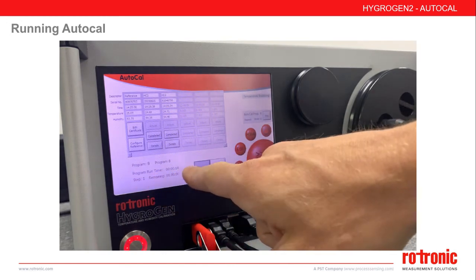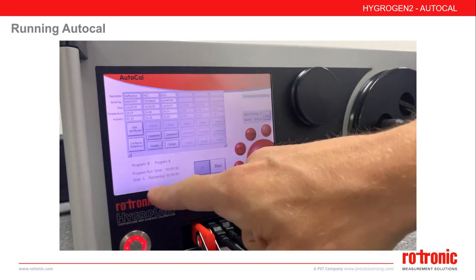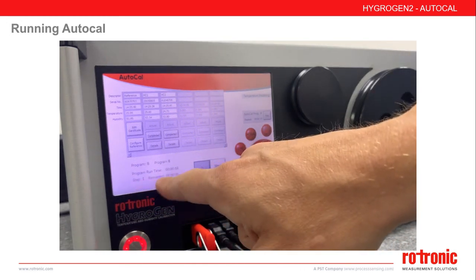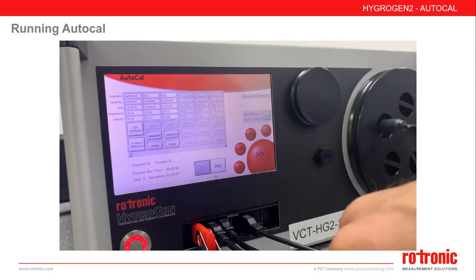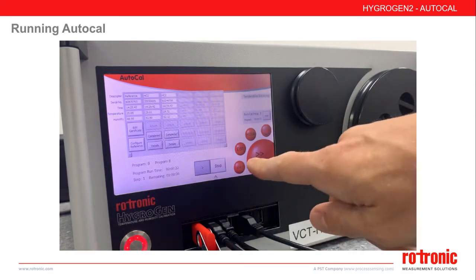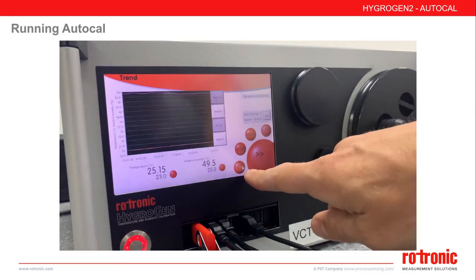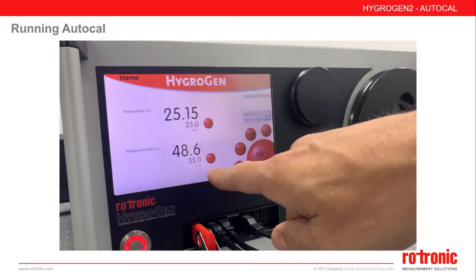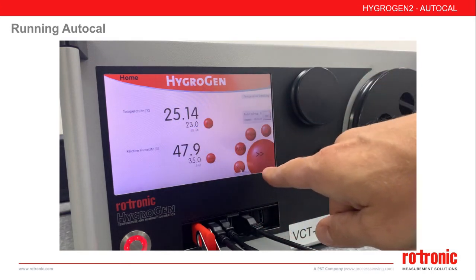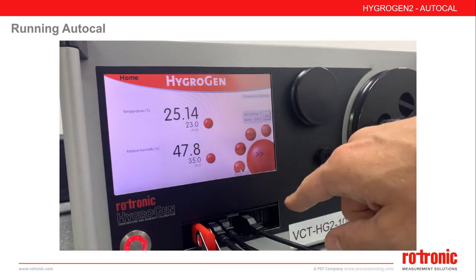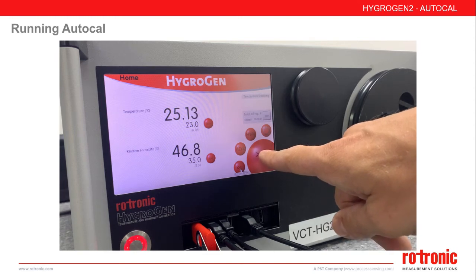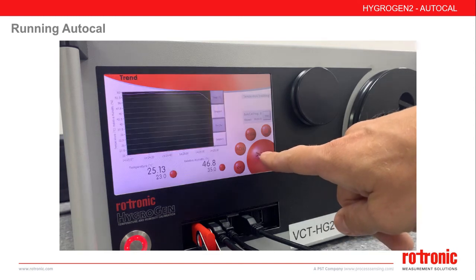In more detail, on the main AutoCal screen you can see the program run time, which step is running, and the step time remaining. AutoCal will automatically move the Hygogen through the relevant set points and create a certificate at the end.